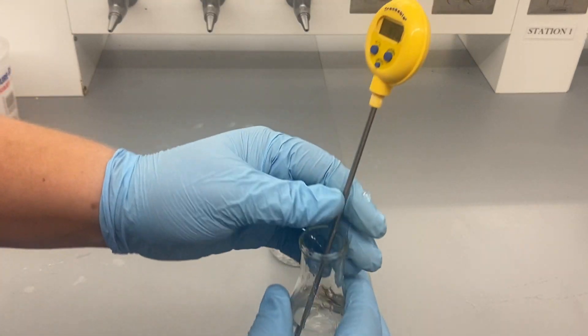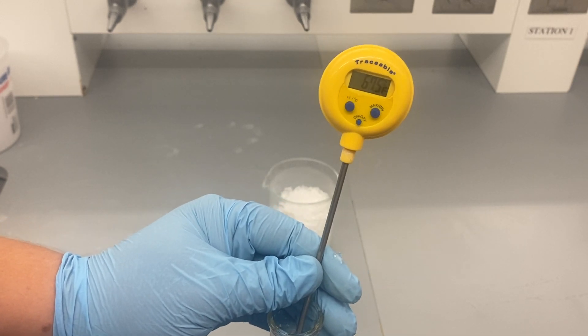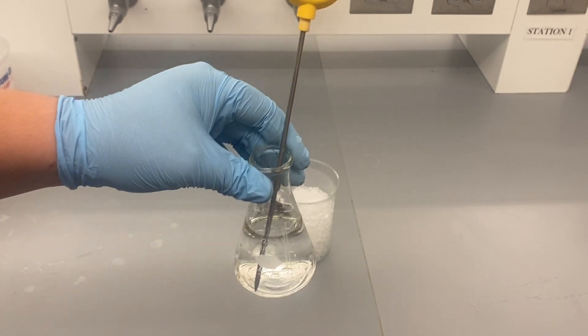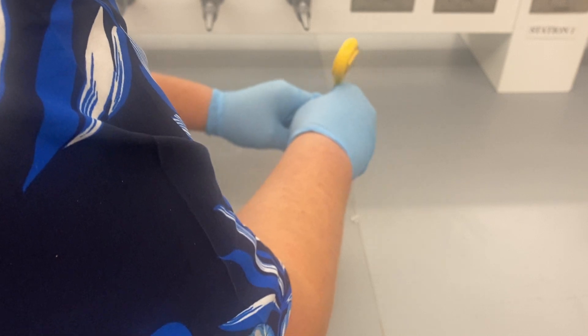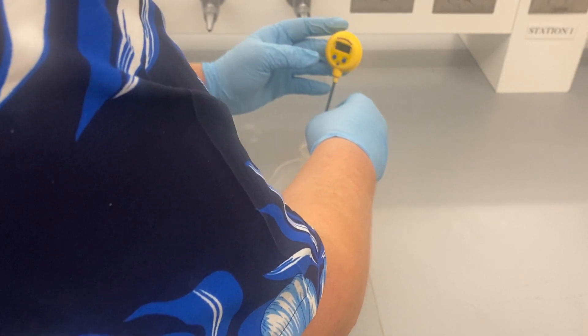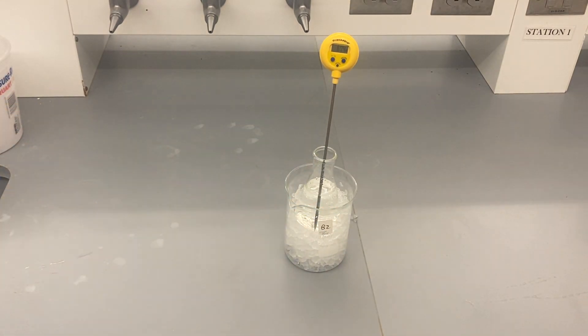And as you can see, I've got my thermometer here currently reading 67.5 degrees Fahrenheit. So all I'll do is sort of nestle that flask within the ice. Now we're going to take a look at what happens to the temperature, and we should see a relatively rapid drop.